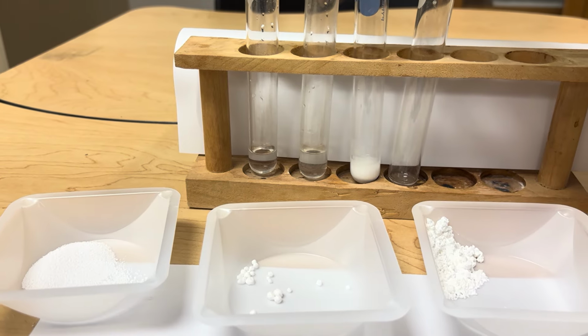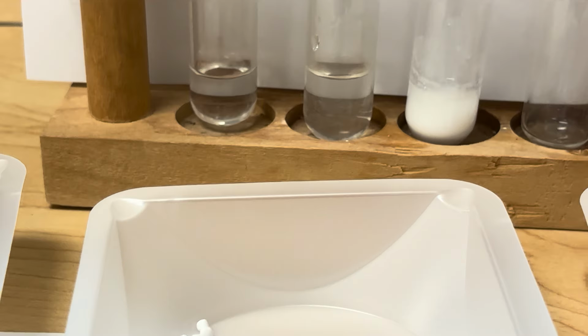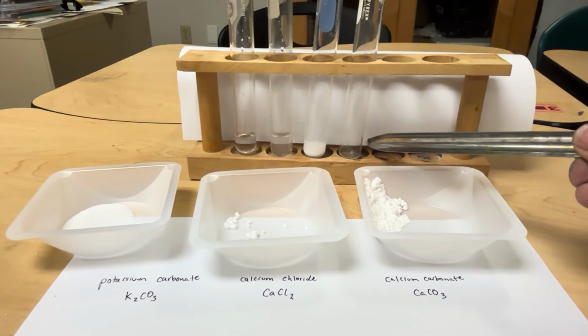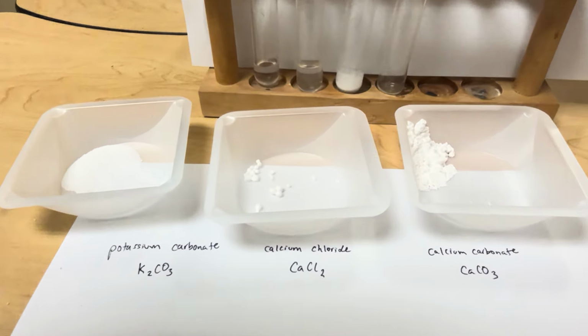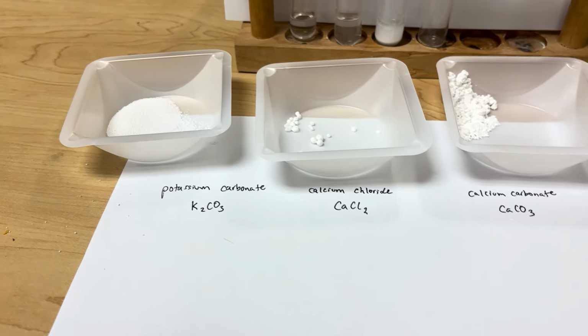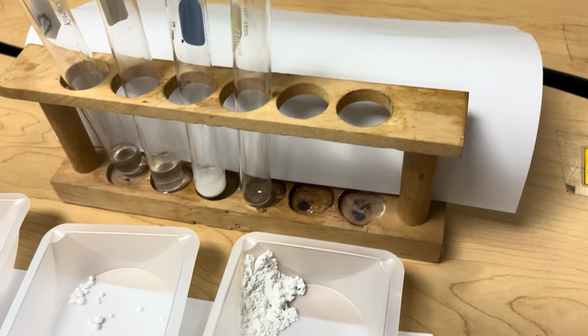Now what I'm going to do is take these two solutions. By the way, that's dissolved completely now. I'm going to take these two solutions of my potassium carbonate and my calcium chloride, and combine them together in this fourth test tube here. Before we do that, let's think a little bit more carefully about what's going to be floating around in solution when I do that.